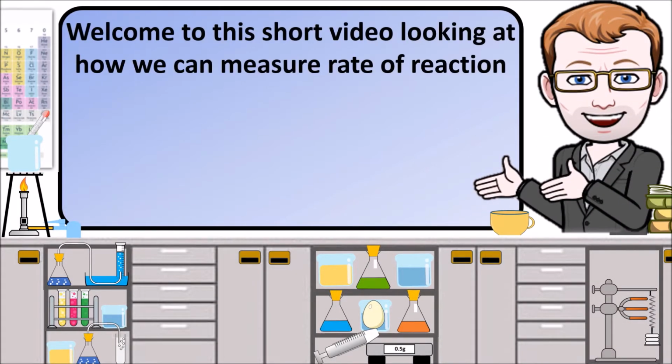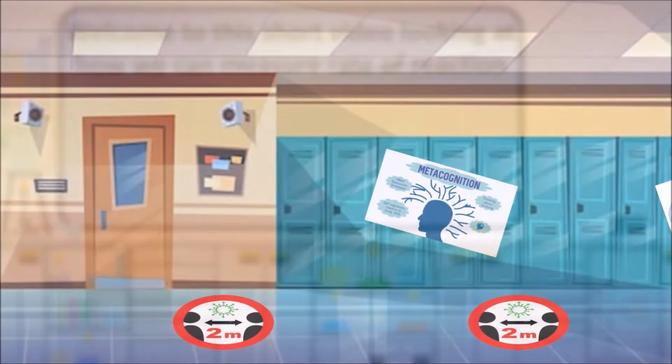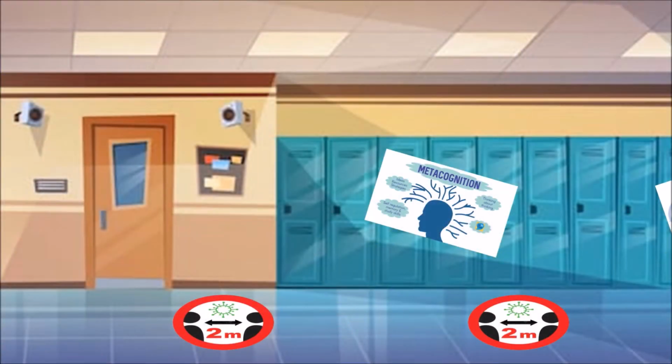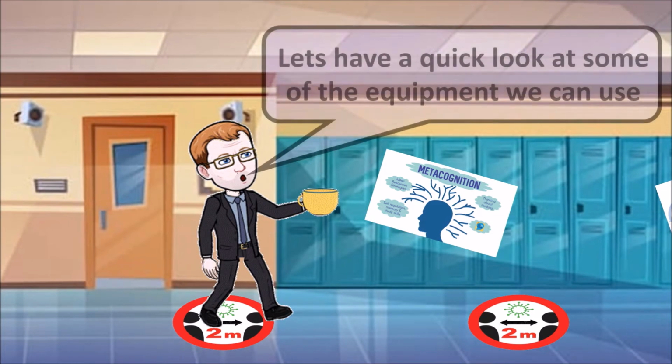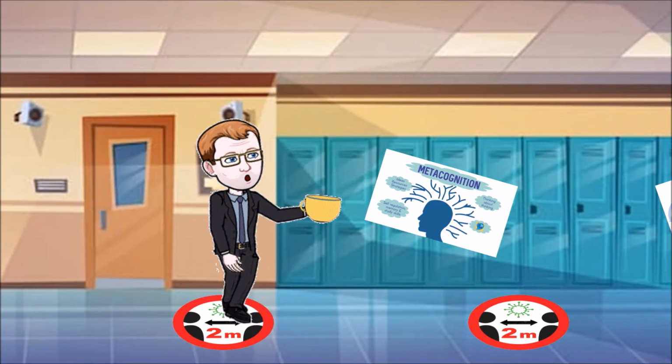Welcome to this short video looking at how we can measure the rate of reaction. In this video we are going to look at how the rate of reaction is affected by changing the concentration of the reactants. So let's have a quick look at some of the equipment we can use.